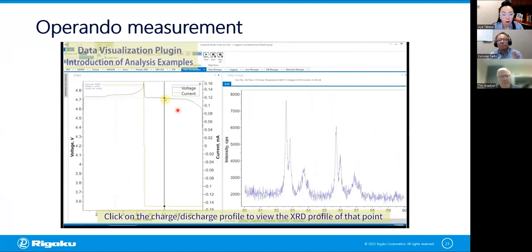So this is the entire procedure: how you could synchronize a measurement, and also how you could synchronize analysis from the potentiostat and X-ray diffraction instrument.